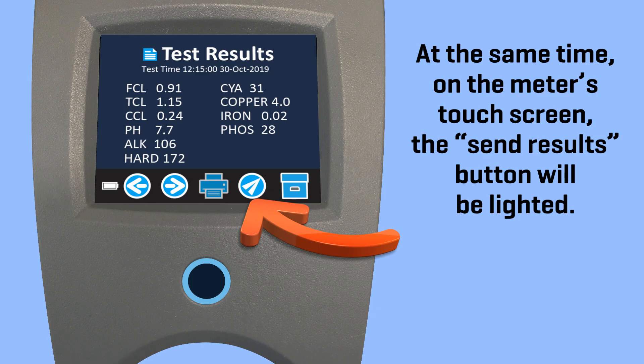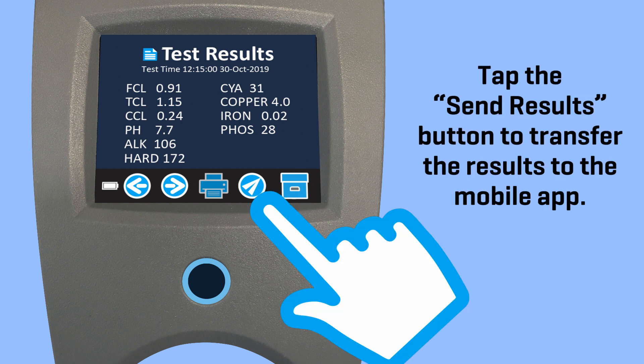At the same time on the meter's touch screen, the Send Results button will be lighted. Tap the Send Results button to transfer the results to the mobile app.